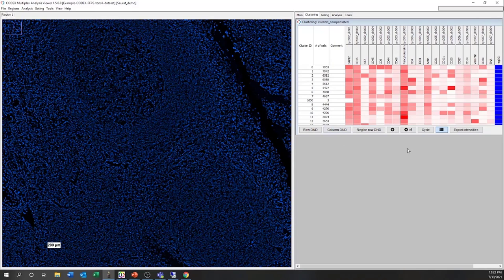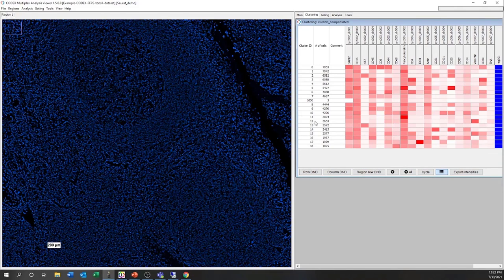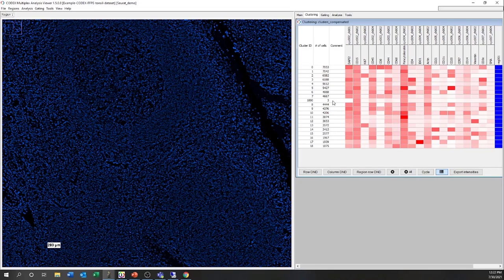We can see here that we have 18 clusters, and one more cluster ID of 1000, which are those three cells that were excluded. Those three cells were labeled with a cluster ID of 1000 just to indicate they were not part of the clustering run — they were excluded. But for the purpose of accounting for all the cells, they've been included in the final results.